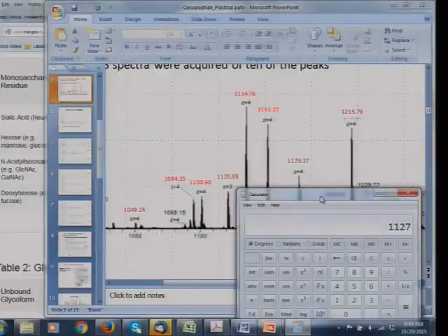Oops, not 1127, it's 1175, wasn't it? The singly charged mass will be 4698.